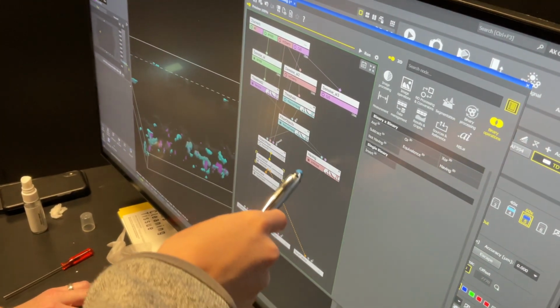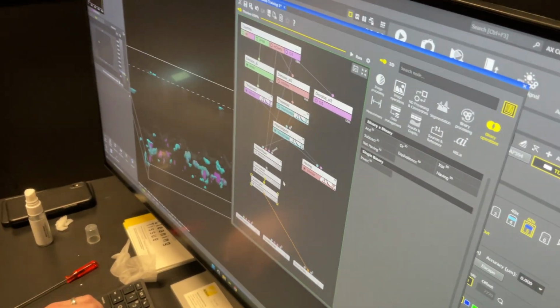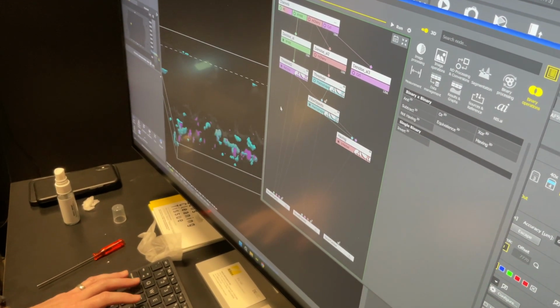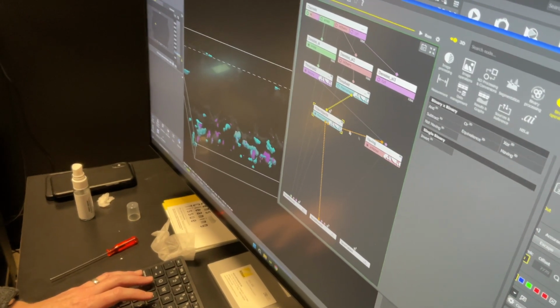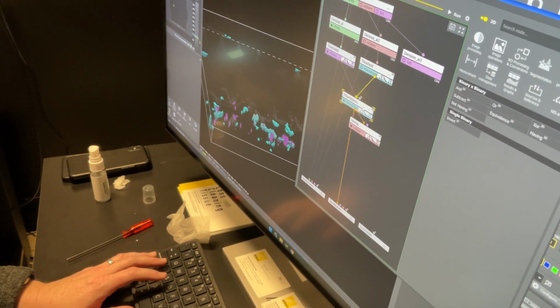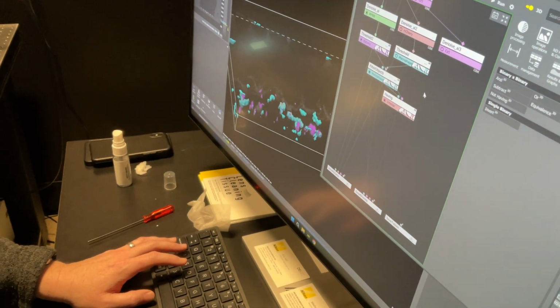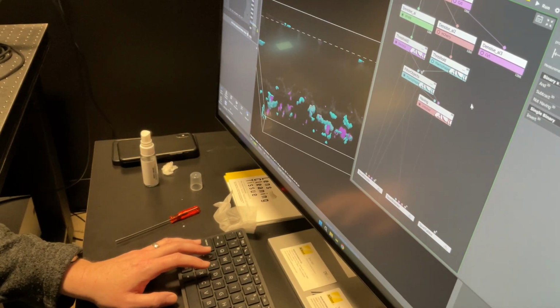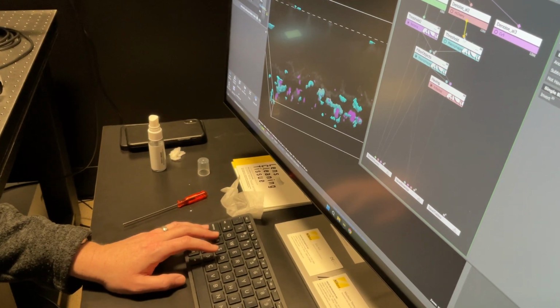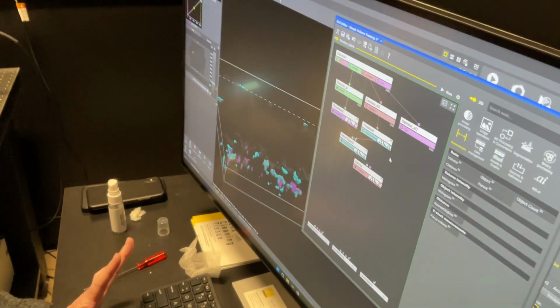Could I link this to the same object measure, or does it have to have its own? There's 2 ways we could approach this. So I'm actually gonna delete these. I'm gonna control click and drag so that I can highlight a bunch, and delete it. And then I'm gonna put these in a way that makes sense to me. This is identifying the infected macrophages, but for my analysis, I want to look at the intensity of the infected versus the uninfected, so I have to have both. We're gonna get there. Once we have that, now they're all just different layers that we can do.